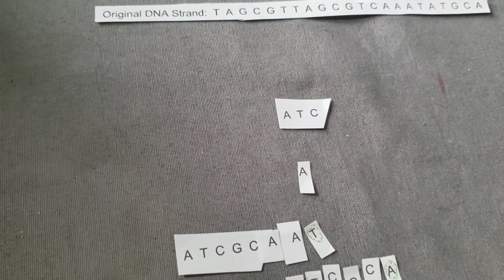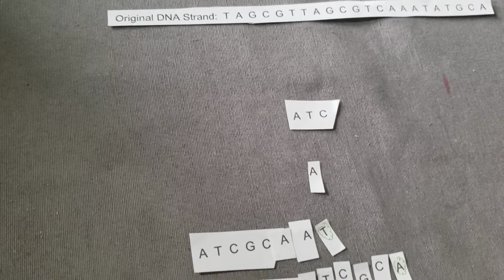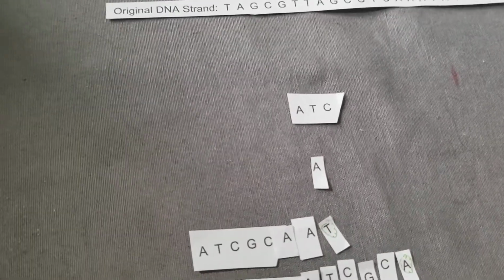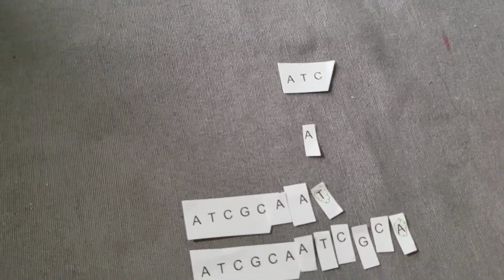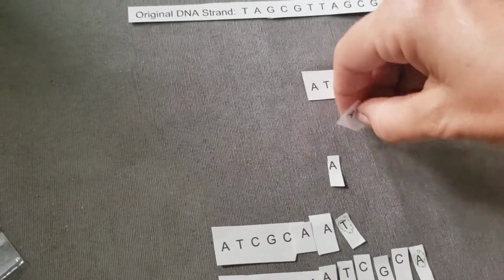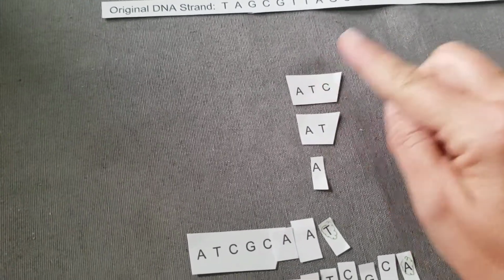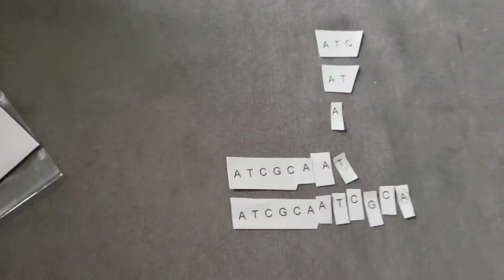The next letters to come through would be a sequence of A followed by T, which I cut somewhere. Here it is. Okay, that one would come through next based on its size. And if the T was fluorescent, it would be read by the laser.